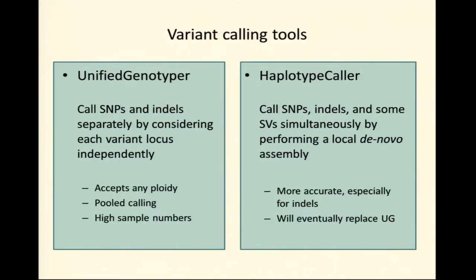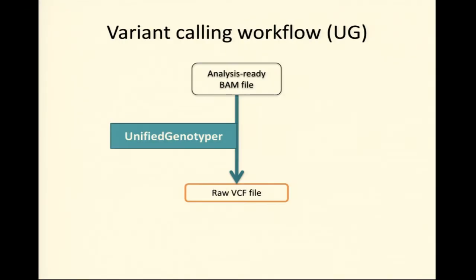So once you're done with this, you have a raw VCF file that you can pass downstream for processing. Now, something important to consider is that Unified Genotyper by default tends to overcall. The philosophy is that we try to call every possible variant given a particular threshold, and then we rely on post-filtering to whittle down the false positives. So, in the sensitivity versus specificity trade-off, in the raw calling, we tend to be more sensitive, and then we rely on VQSR to whittle down the false positives.